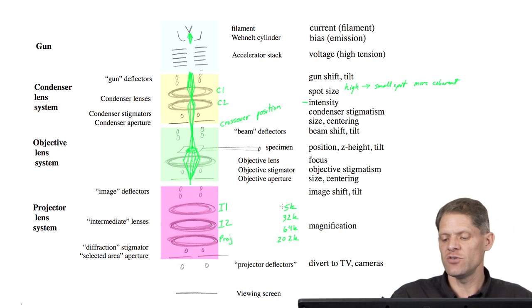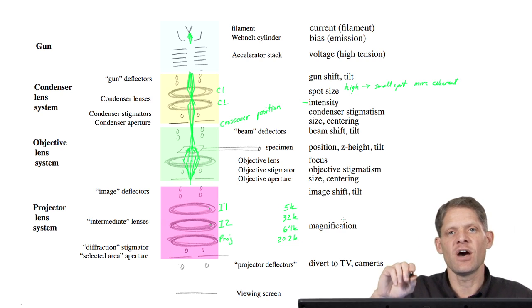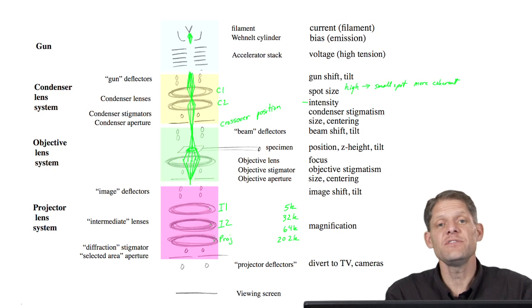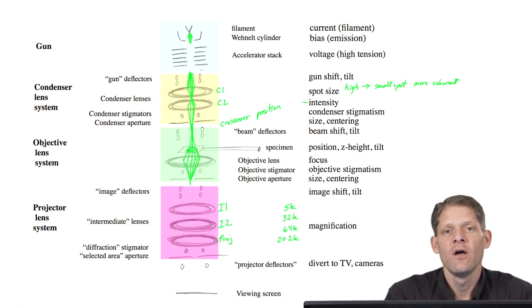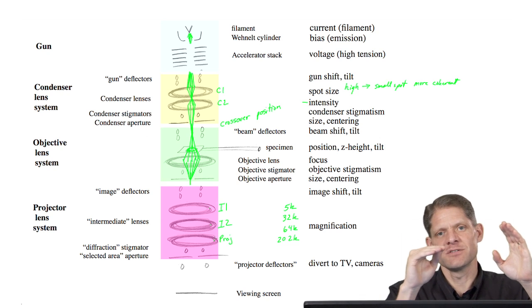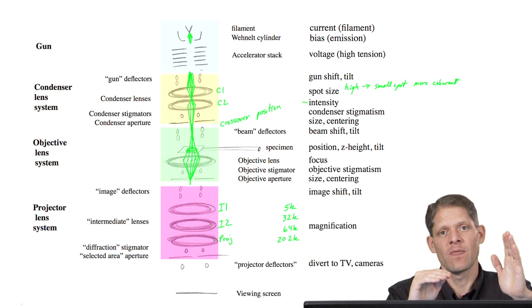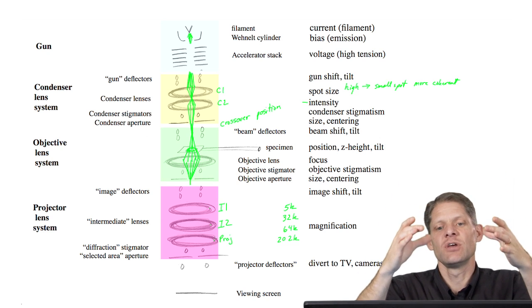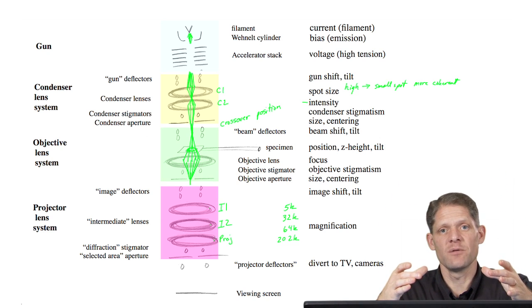So all you have to do is change the magnification knob to choose between these major step sizes, and the currents in all the lenses will change. Having a number of preset magnifications also allows the microscope manufacturers to choose a set of lens currents in the different lenses that will minimize the net rotation of the image as it comes through the column.